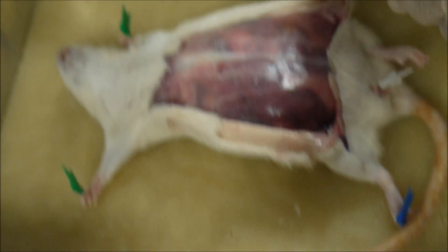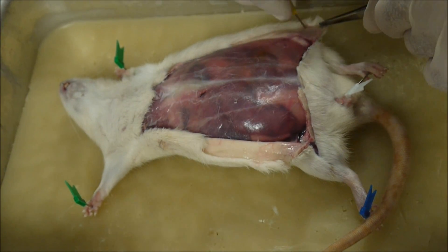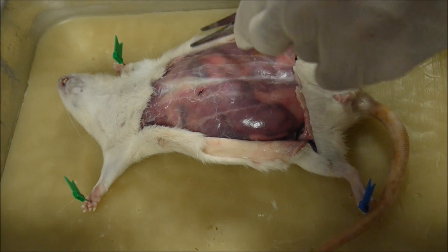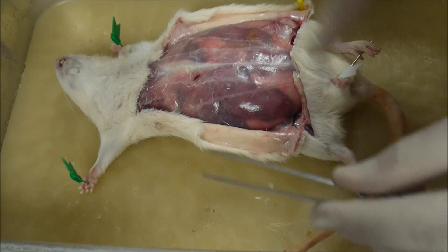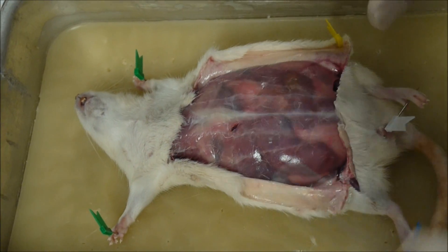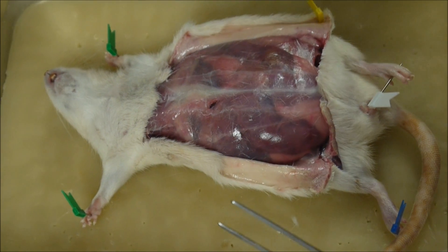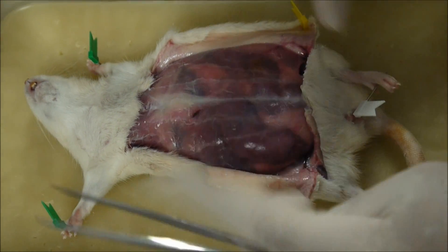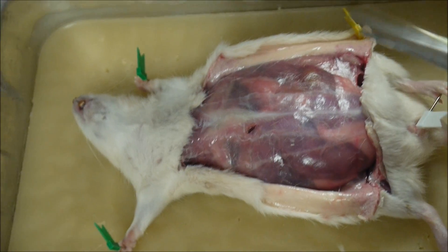And then you can pin this back with some more pins. We'll just pin there. I just wanted to show you that first. Now you can see the muscles. You can see some of the organs in here. This is a pregnant rat, so there'll be a lot of fetuses in there, and you can see how the abdomen is really swollen with the fetuses.